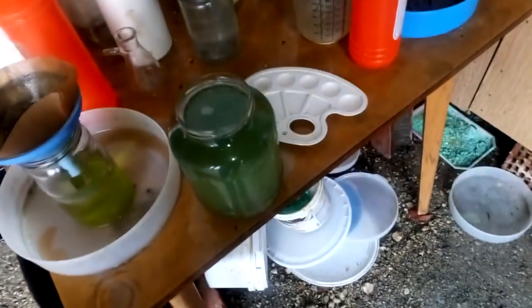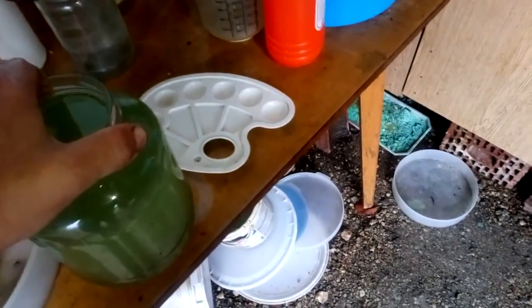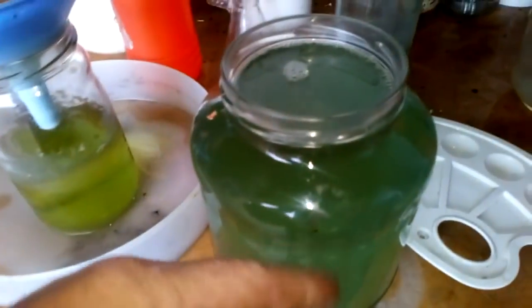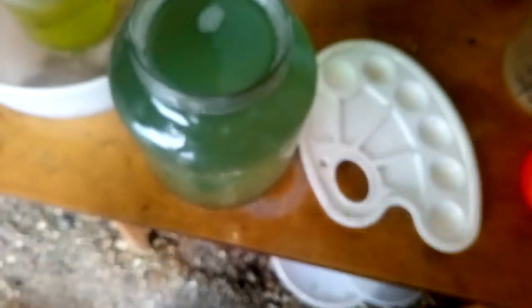Hey guys, what's up? Today we got a small video about refining dirty gold solution. Here I got some gold, but it's not pure. You can see by the leftover solution that it has base metals, and the sediment is not pure. Now we will refine that with acid and bleach. First we will decant this and filter.